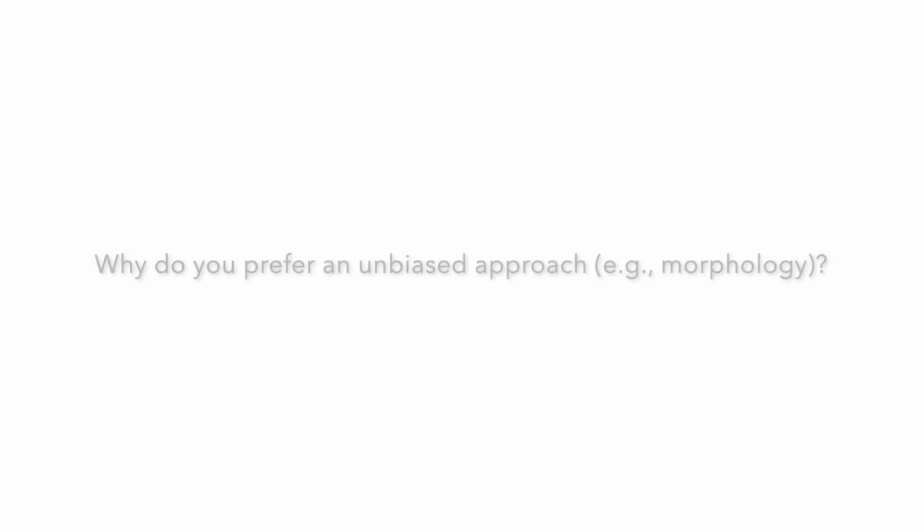So someone asked, why did you prefer a more unbiased approach for your analysis? How did classic markers limit your research? Yeah, well, that's an excellent question because for classical analysis like flow, we are limited to what we know. So the morphological analysis would probably provide us with a lot more ability to follow up with perhaps cell populations that are not detected by the classical flow markers.